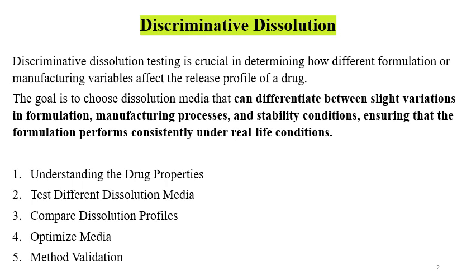This video is also important for the professionals who want to understand the development of QC release media or QC dissolution method, because many times the professionals get confused between discriminatory dissolution and QC release media. So don't get confused between those. QC release dissolution method is required to be discriminatory in nature. So you should learn from this video regarding both the dissolutions.